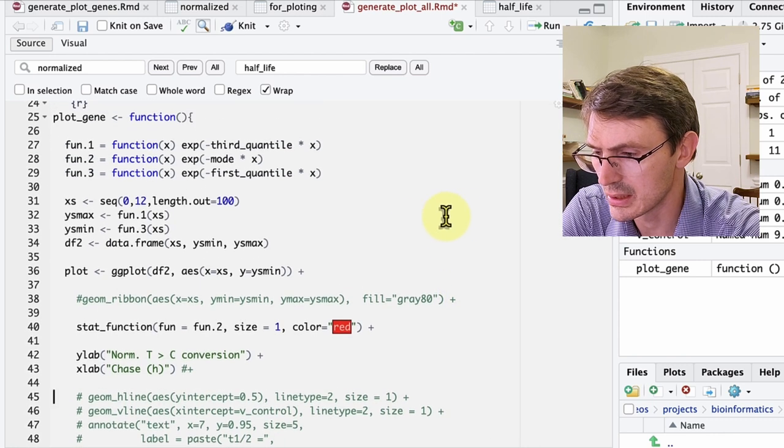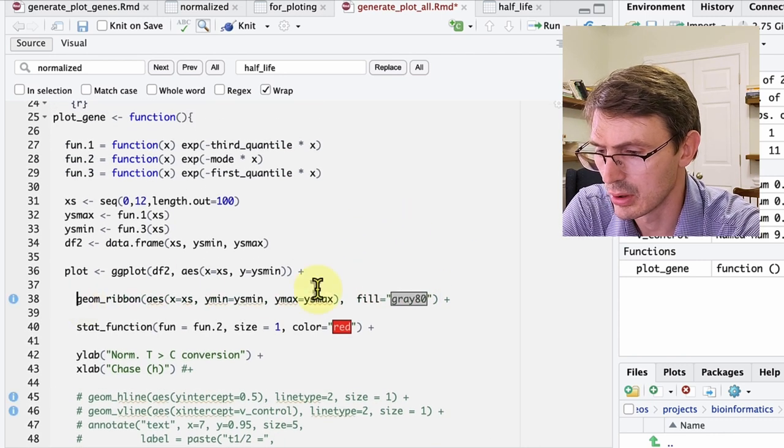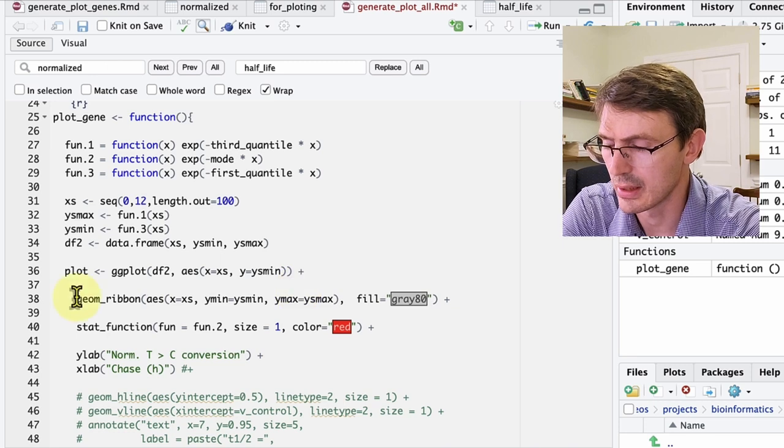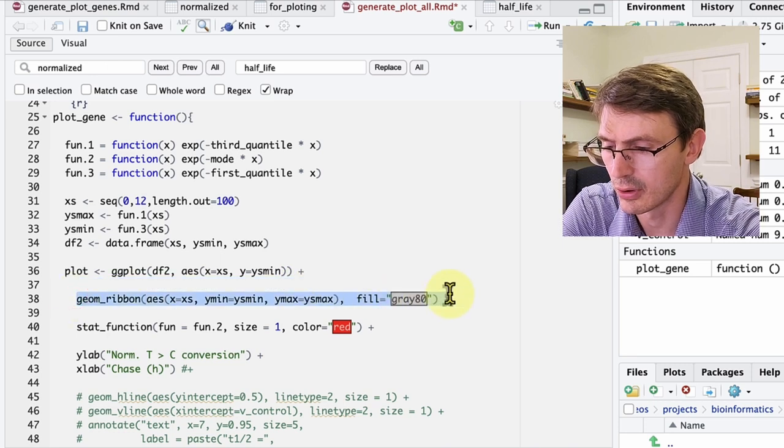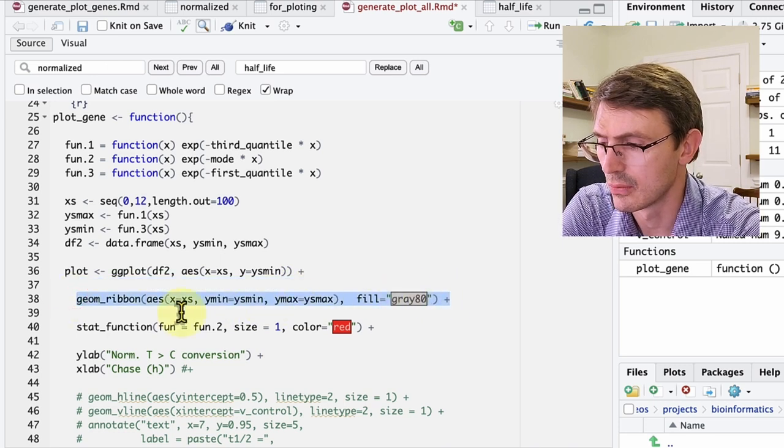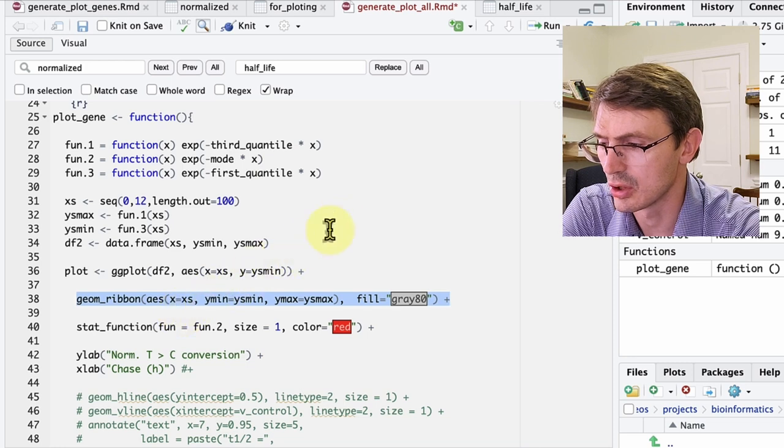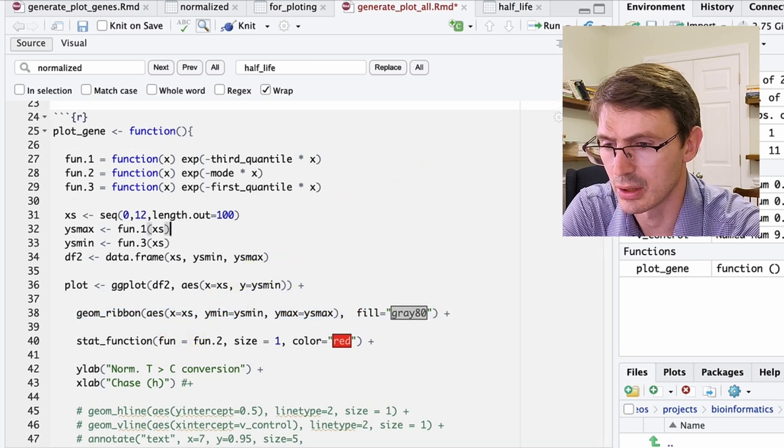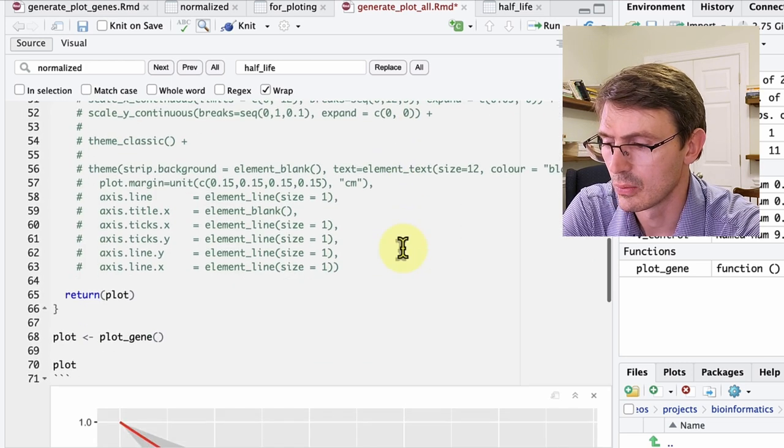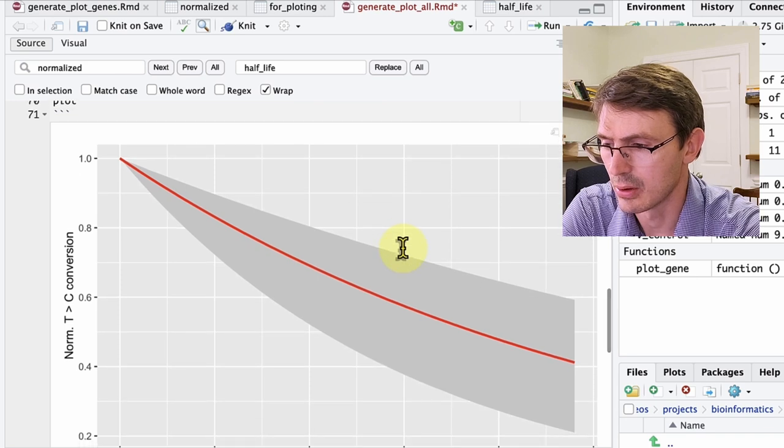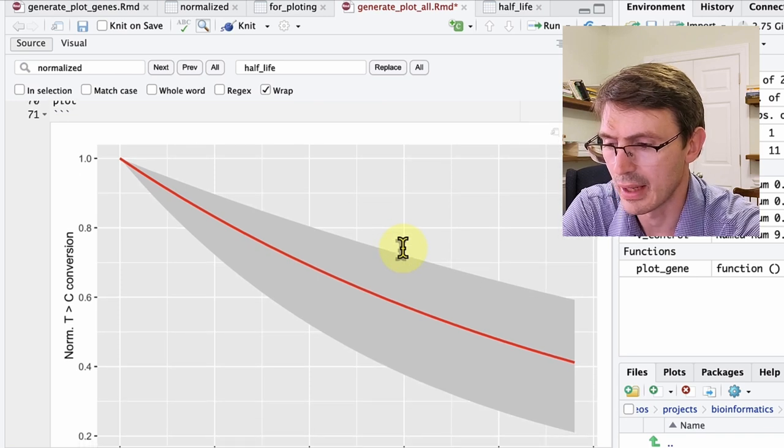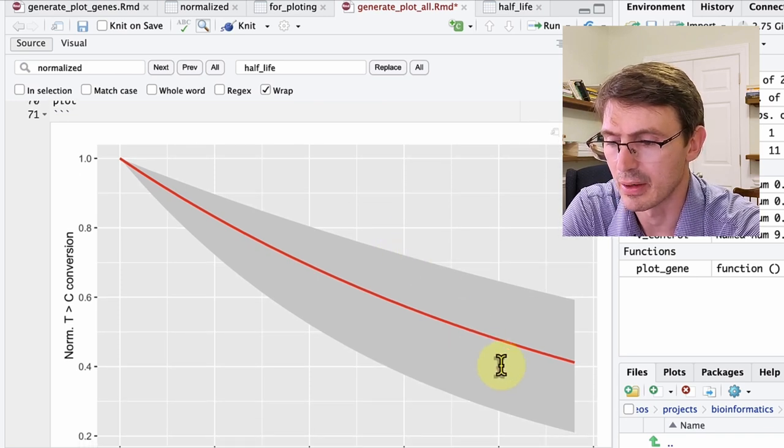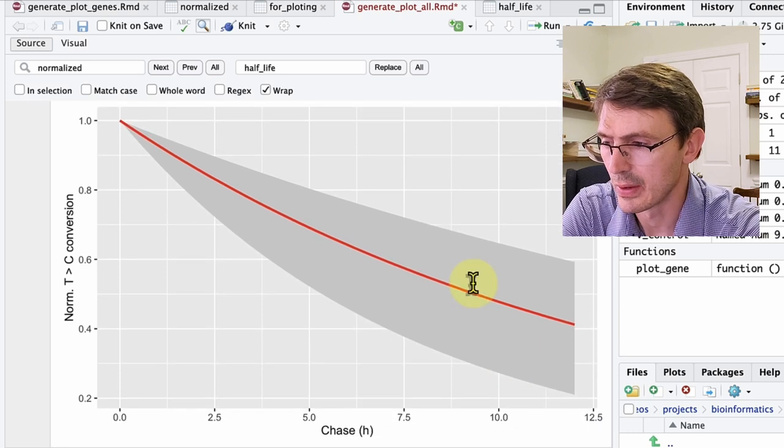So to do that, what I'm going to do is add a shade to the plot that shows the first quartile and the third quartile range for the decay using this geom ribbon function here. So if we run that, what we get is now this range of half-life just to have an idea of the variation within the population.